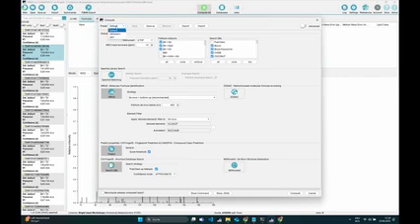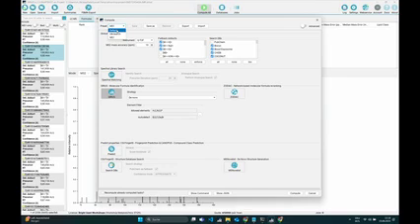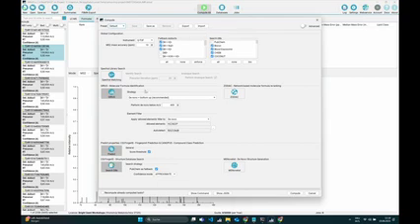So you have some presets that are already set. For example, the default preset, database search preset, MS1 preset. Let's go back to the default preset. You can also make your own presets and save and export them. So just a few more settings.